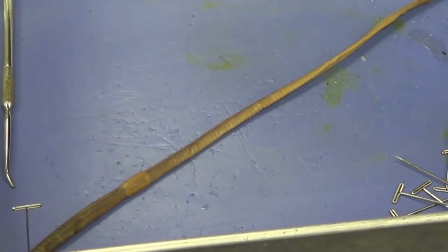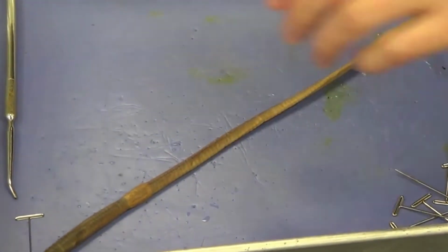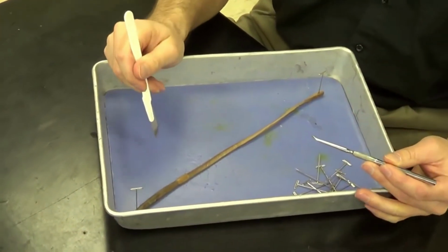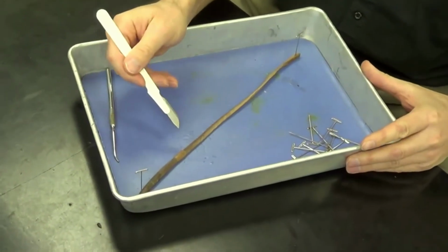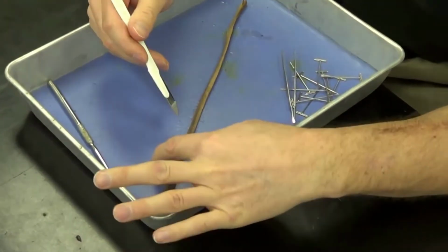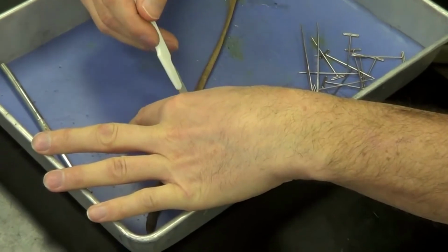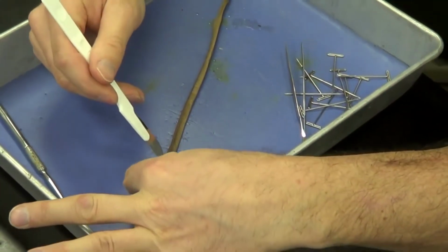So you pick up your scalpel, you're going to hold it like a pencil. And I like to use the very tip of the scalpel, so I hold it almost vertically. And I'm going to hold it at an angle also. I'm going to grab my forceps and I'm going to begin cutting. Now when I cut, I always cut away from my hands or between my hands, but never toward. You never want to cut towards your hand. So I'm going to cut away from my fingers.